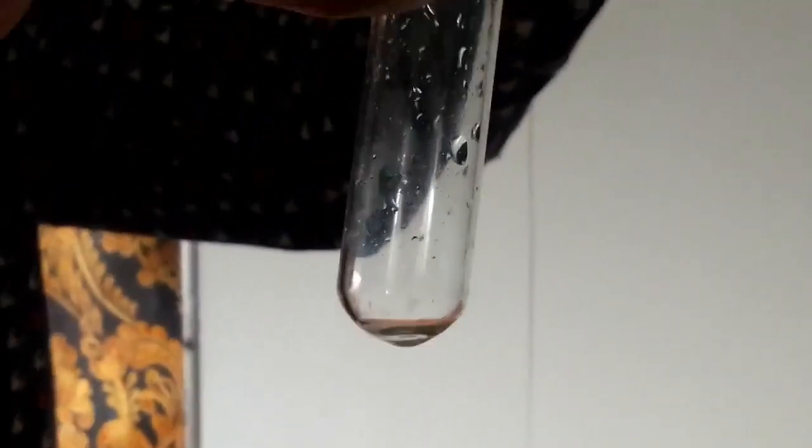We want to find out the cation that is present in this salt using aqueous ammonia. I'm going to get a clean test tube, and from the solution I have obtained here, I'm going to take a small sample, a little amount, which is okay for the test. Then we're adding ammonia to this solution. So this is our ammonia.